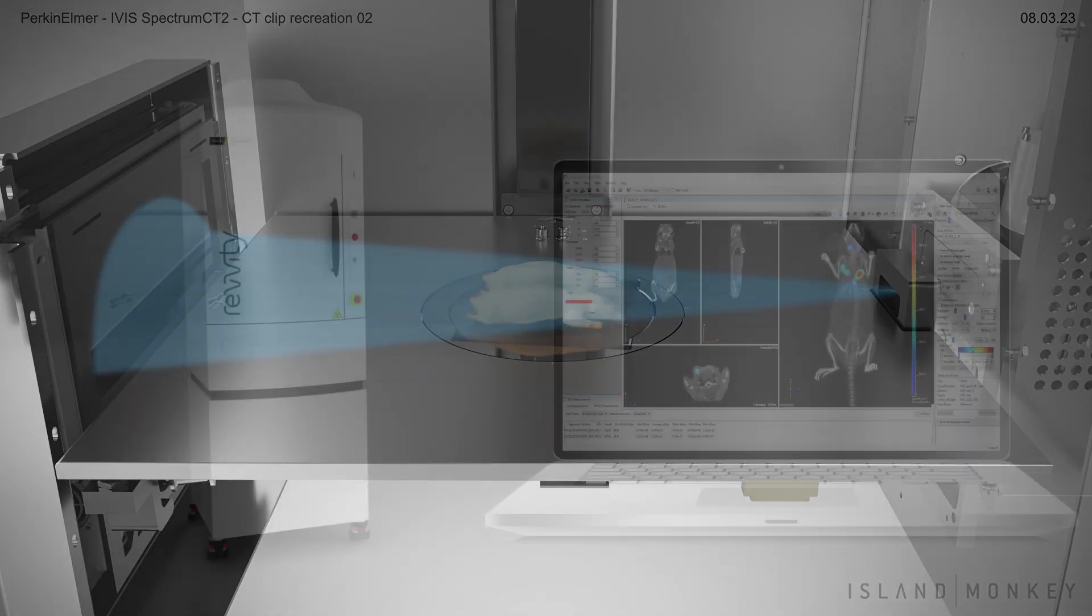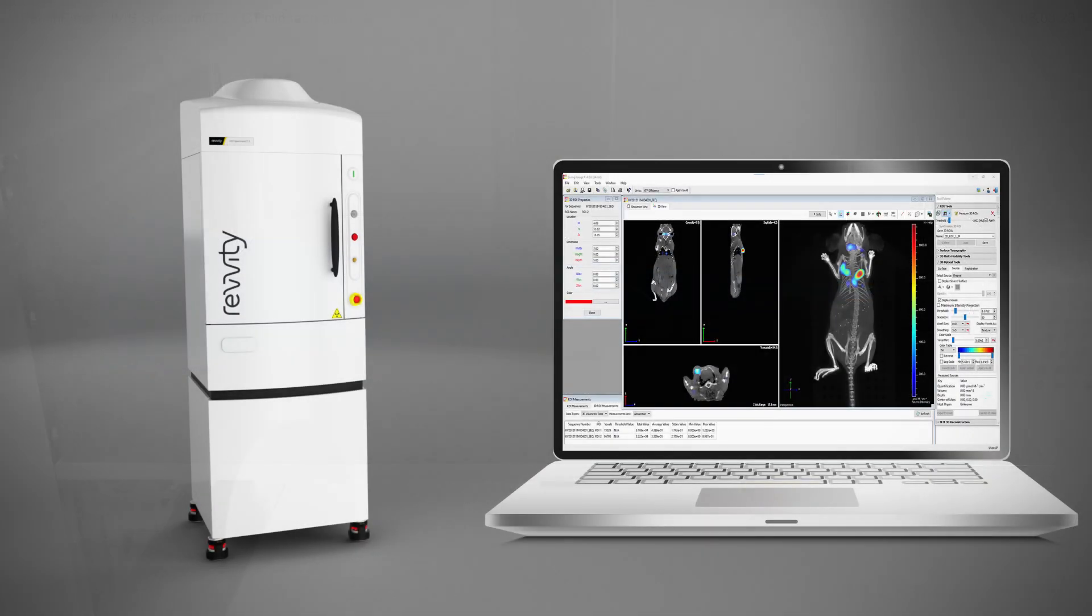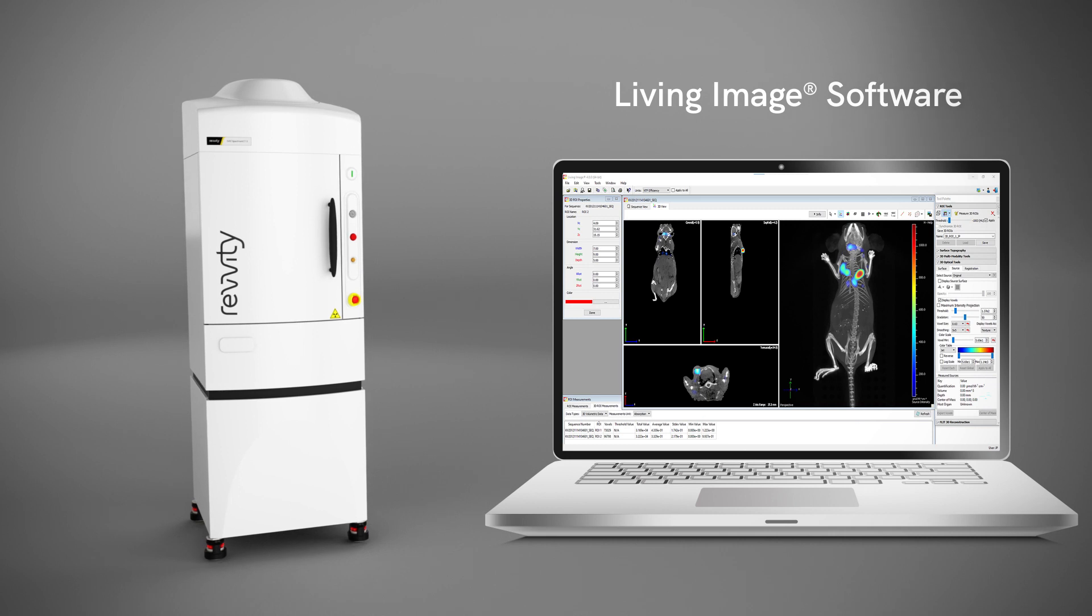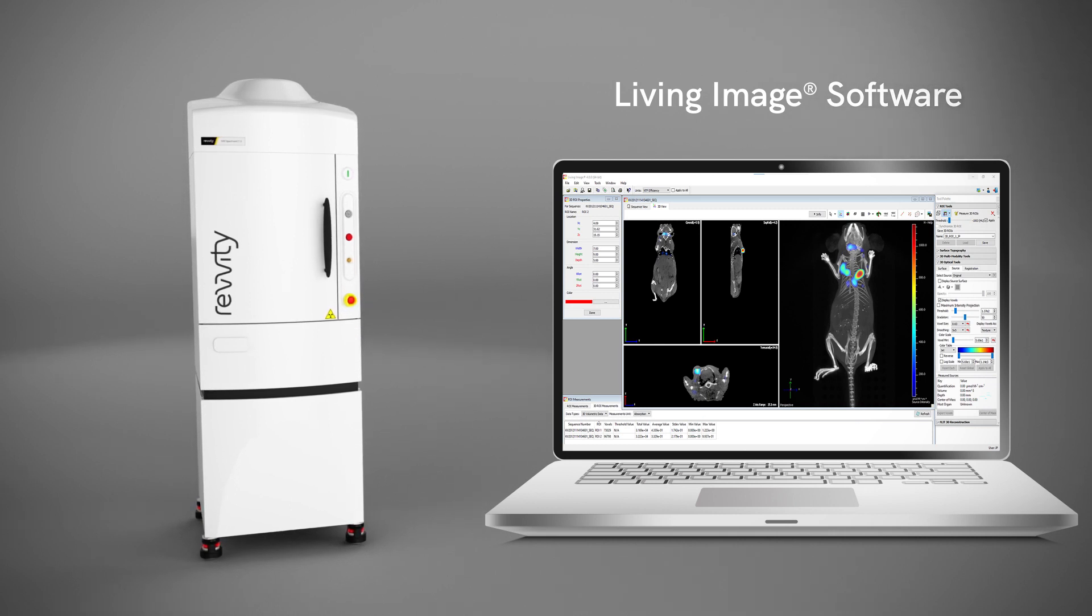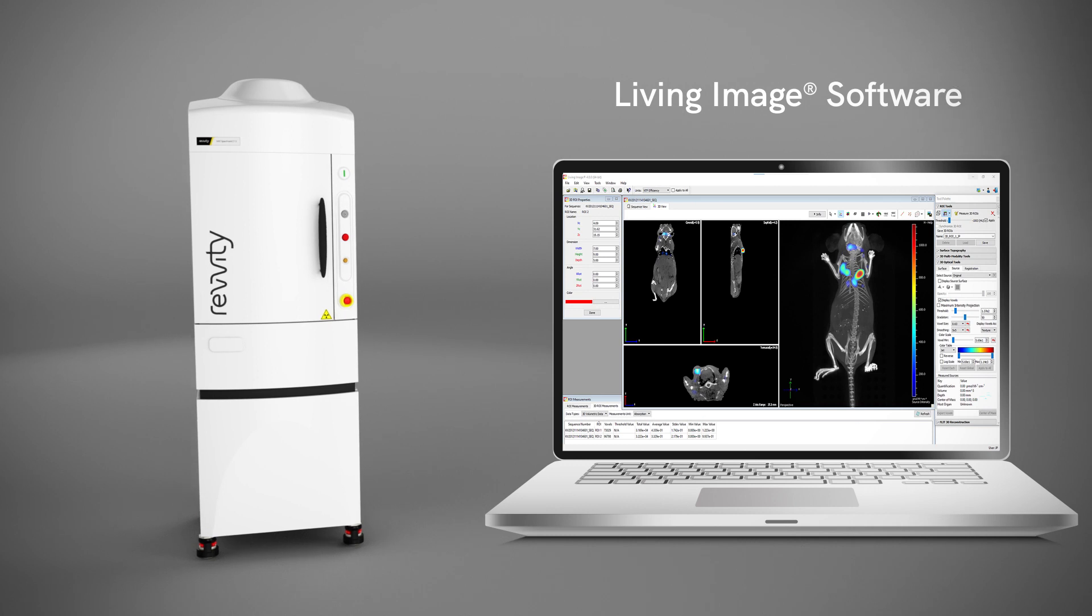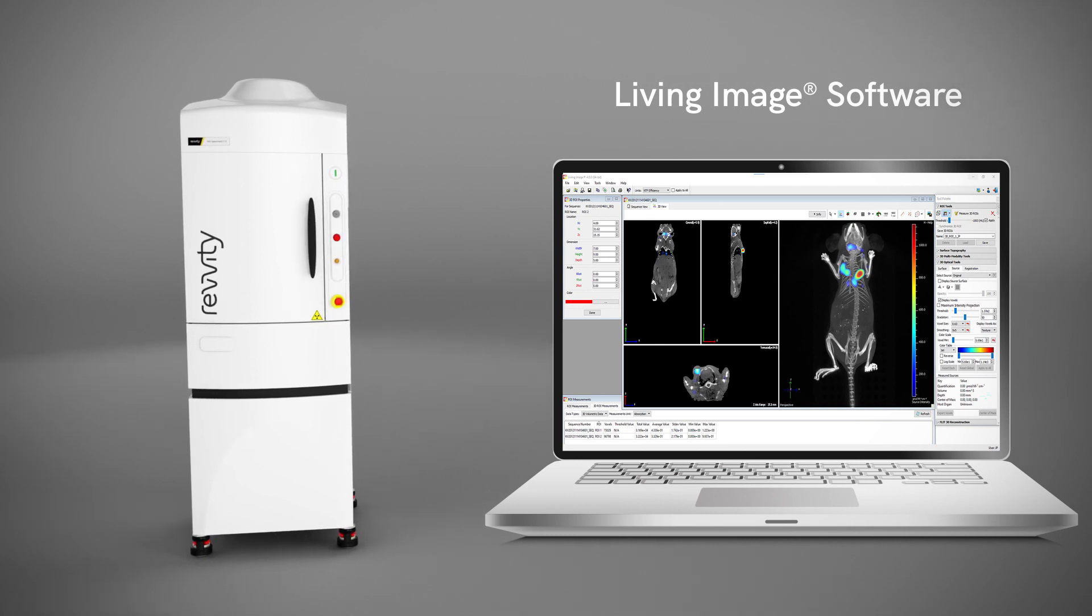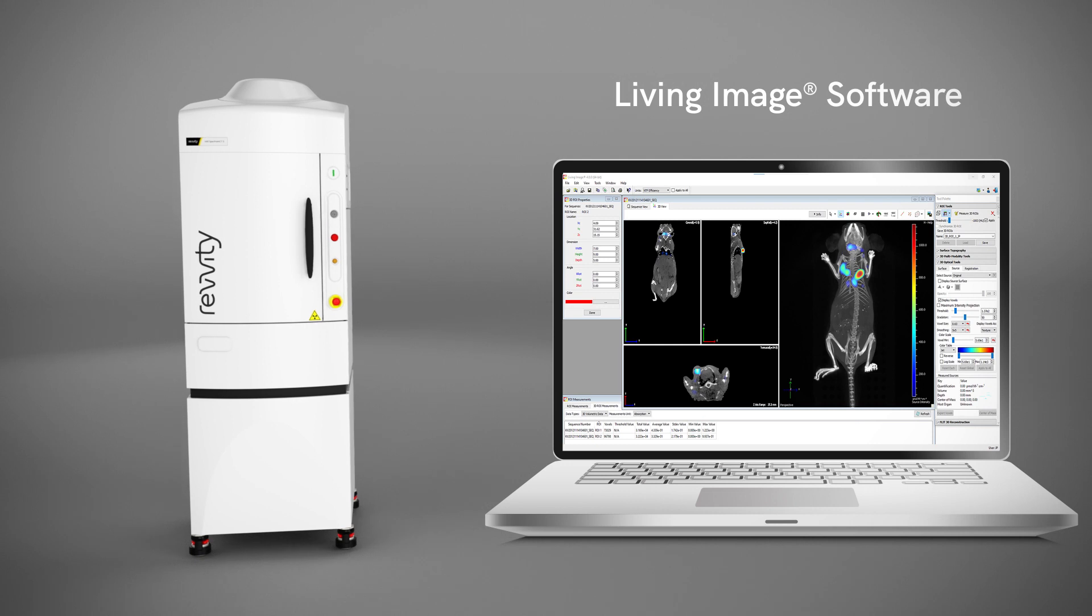Bring your images to life with our broadly adopted Living Image software that sets the standard for ease and flexibility, and simplifies even the most complex acquisition and analysis of bioluminescent and fluorescent sources.